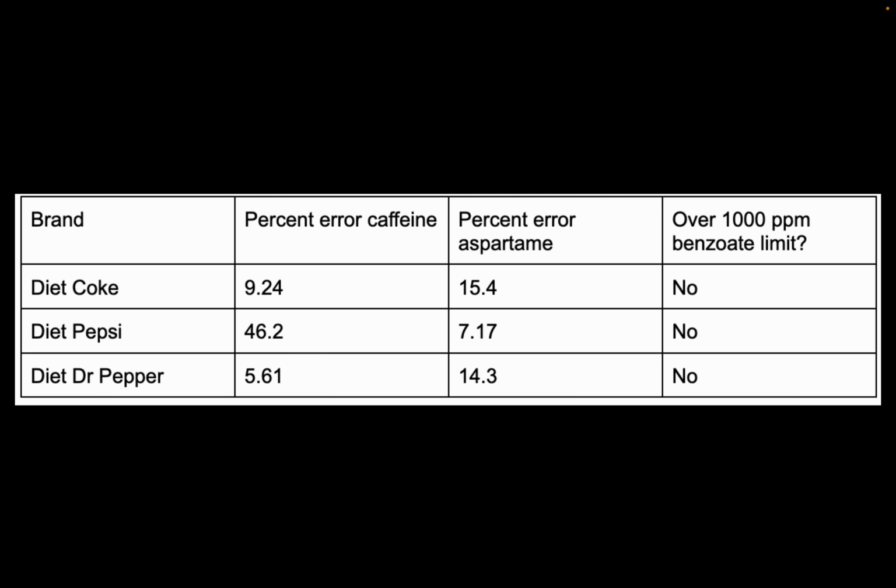But Diet Pepsi, right, decided, I don't care. I'm going to give you 46.2% error.